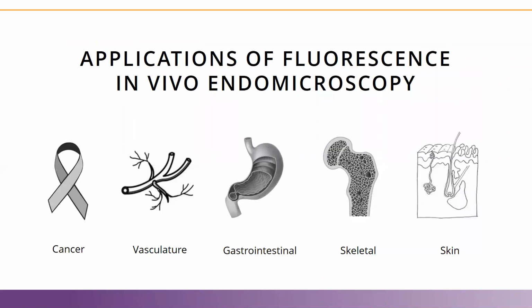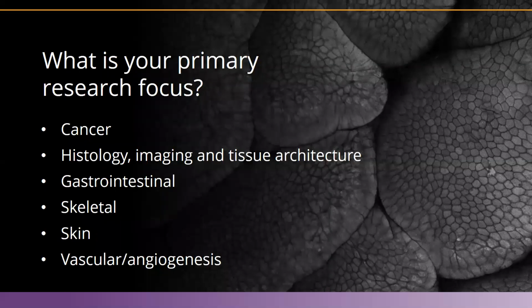Now let's talk about some of the applications of this technology. For example, we will discuss cancer, vasculature, skeletal and skin imaging. But before that, if you can allow me to understand what animal models you are working with, so that based on that I can emphasize some of these applications. So if you can quickly answer some of these models that you're working with?